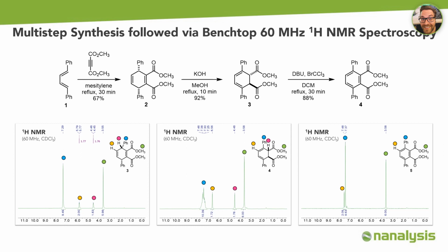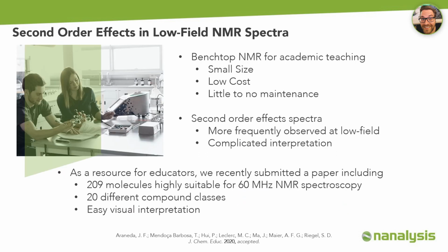The assignment of the proton NMR spectra is easy and in well agreement with the stereoselectivity of the Diels-Alder reaction. Chemical shift, integration, and multiplicity can be discussed in regard to the molecular structure of the synthesized compounds. We learned that size, cost, and the maintenance characteristics make Benchtop NMR instruments an attractive option for providing first or second year chemistry students with a hands-on introduction on NMR spectroscopy with high respect to meaningful learning.